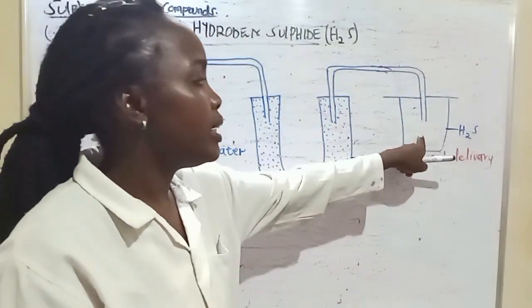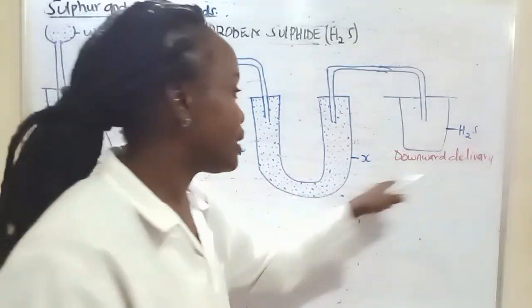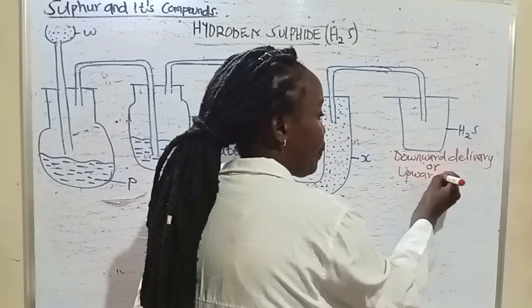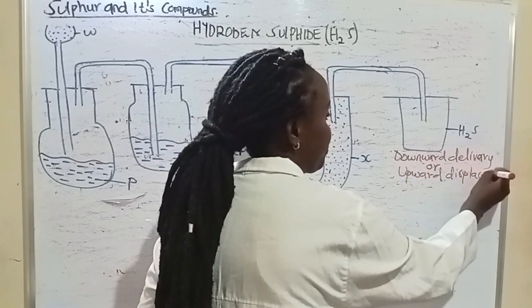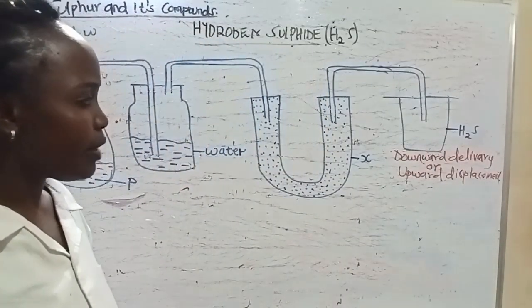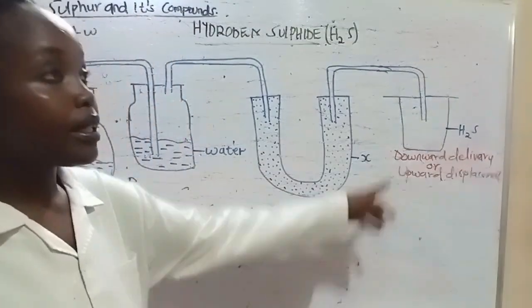Downward delivery is also what we refer to as upward displacement.